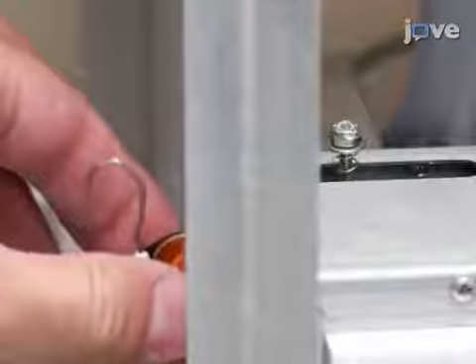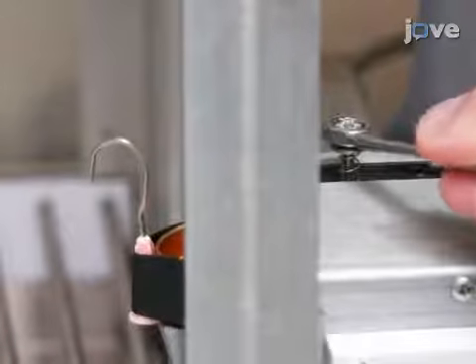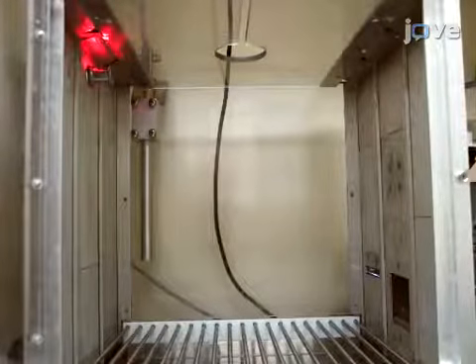To calibrate the lever, place a 10 gram weight on it and adjust the calibration screw until the weight pushes the lever down. Then, attach a red light to the roof of the chamber above the receptacle. This will increase the conspicuousness of the illuminated lever.